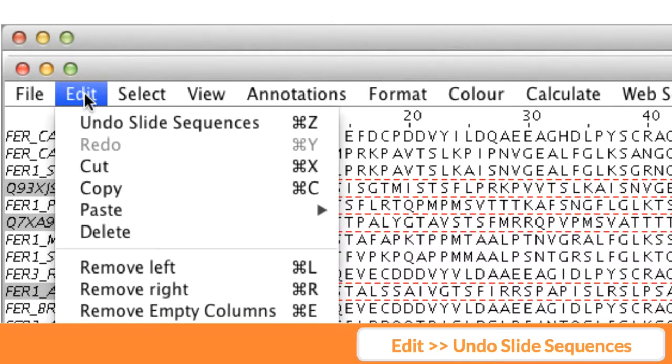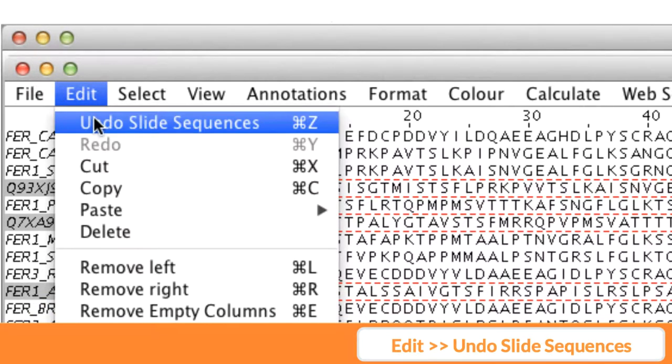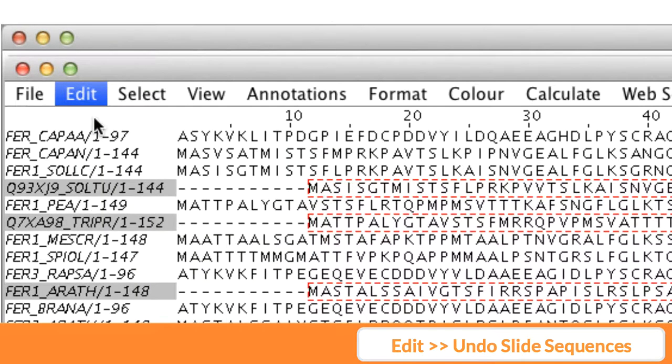This editing can be undone by going to the Edit menu in the alignment window and selecting Undo slide sequences.